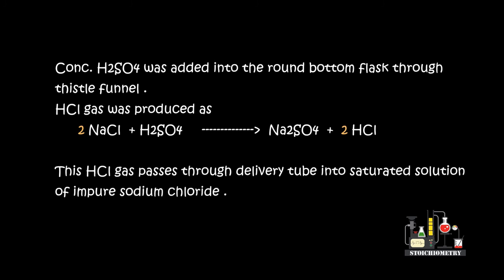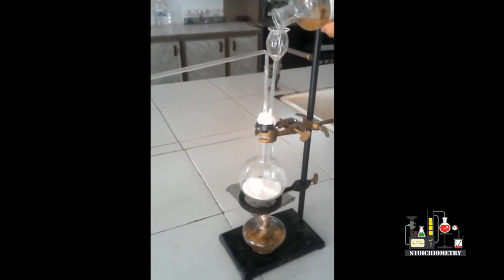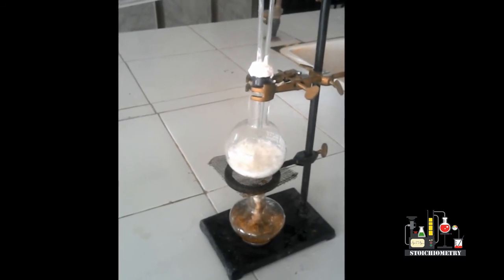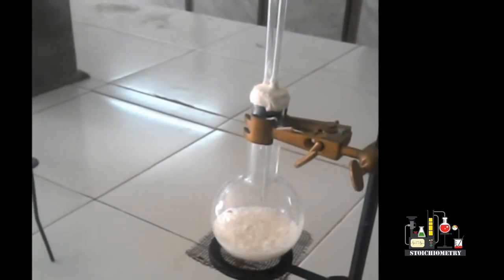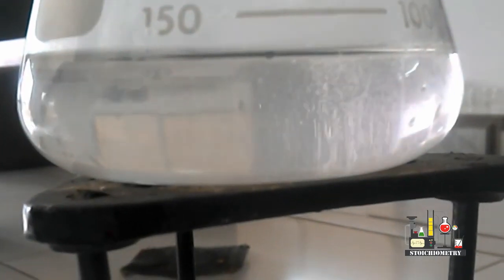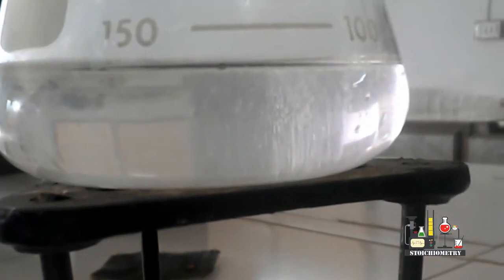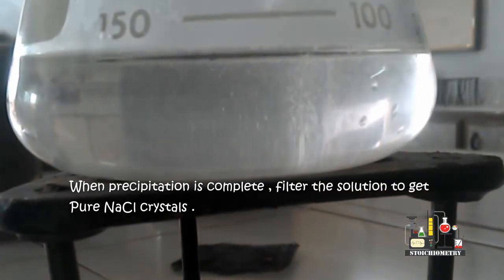Concentrated sulfuric acid is added into the round bottom flask through the thistle funnel. The hydrogen chloride gas passes through the delivery tube into the saturated solution of impure sodium chloride. The pure crystallized sodium chloride is formed. When precipitation is complete, filter the solution to get pure sodium chloride crystals.